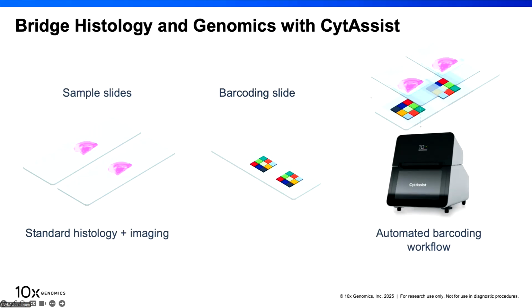The advantage of using this technology is that you will stain the tissue section before running Visium. So at that point, if something doesn't fit, if the section has been damaged or the RNA quality is too low, you haven't used the reagent yet, so you haven't spent the money yet.